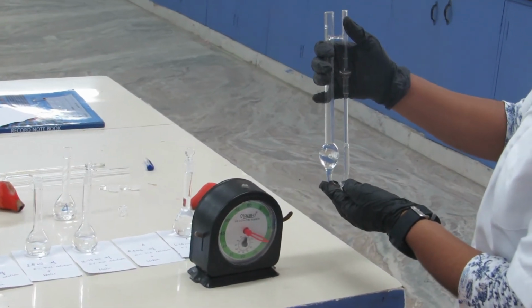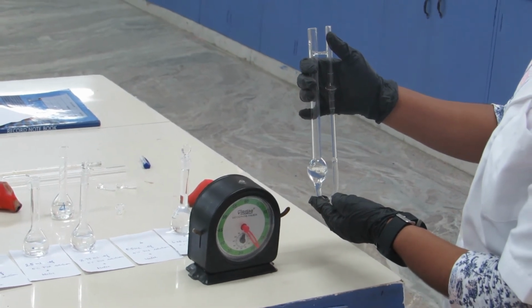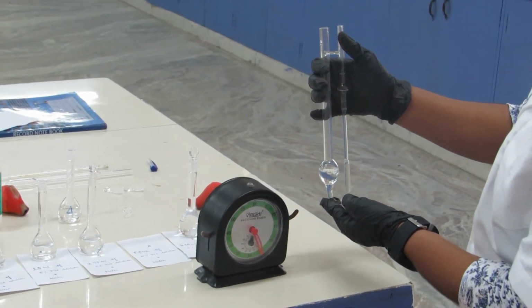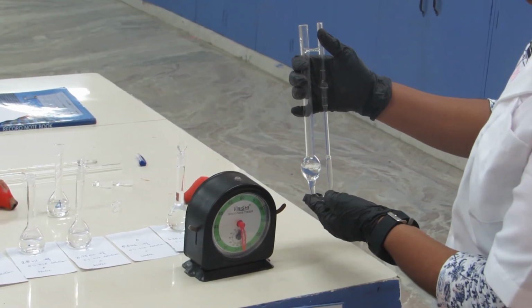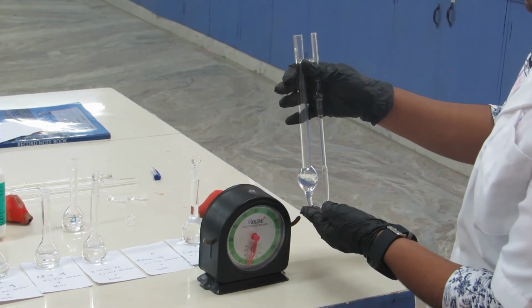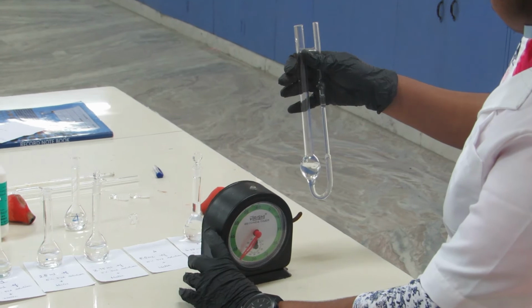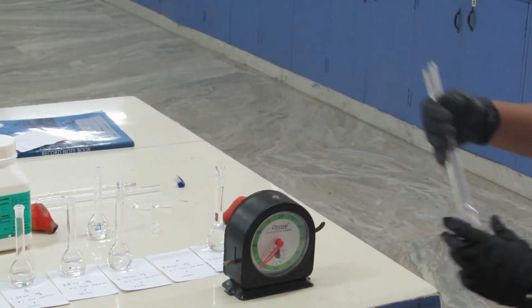See, now the PVA solution is flowing. We have to find out the flow time between the two marks, okay, whatever we have on the viscometer.